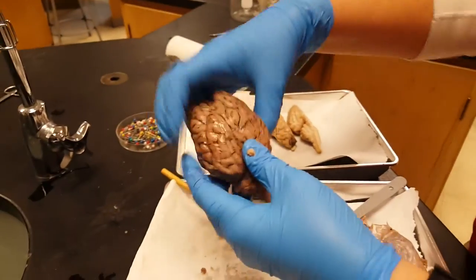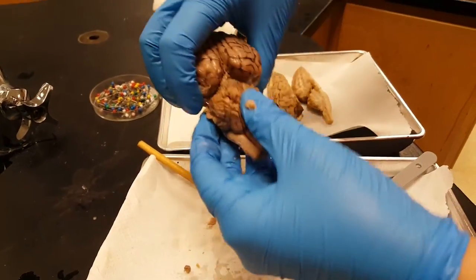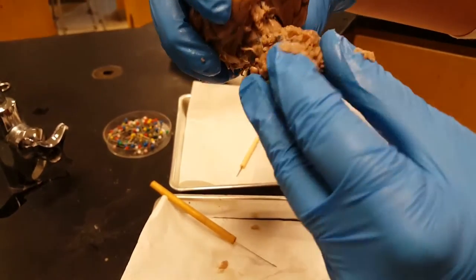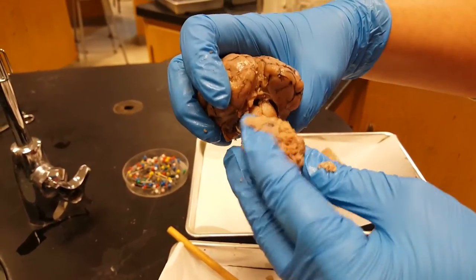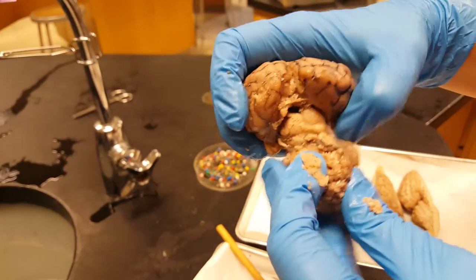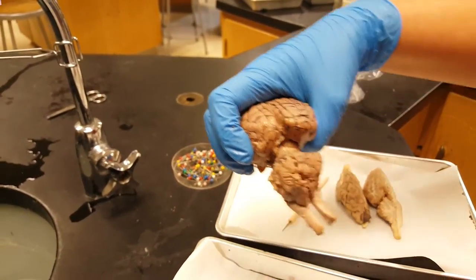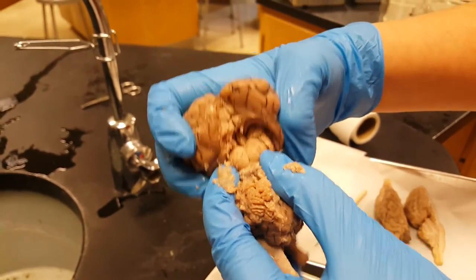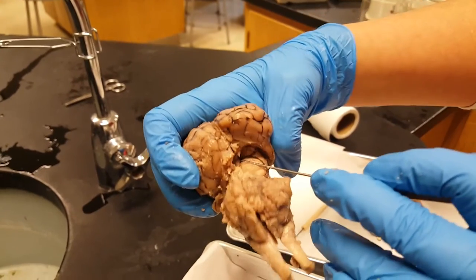When you open the brain up, one of the features you'll see from both the inside and outside is this little structure here, which is on the inside. When you pull the cerebellum down, you can see that part that kind of looks like a butt — that's called the superior colliculi. The smaller one underneath it is the inferior colliculi. And even deeper within there — in the butt crack, so to speak — is a little nub, which is your pineal gland.